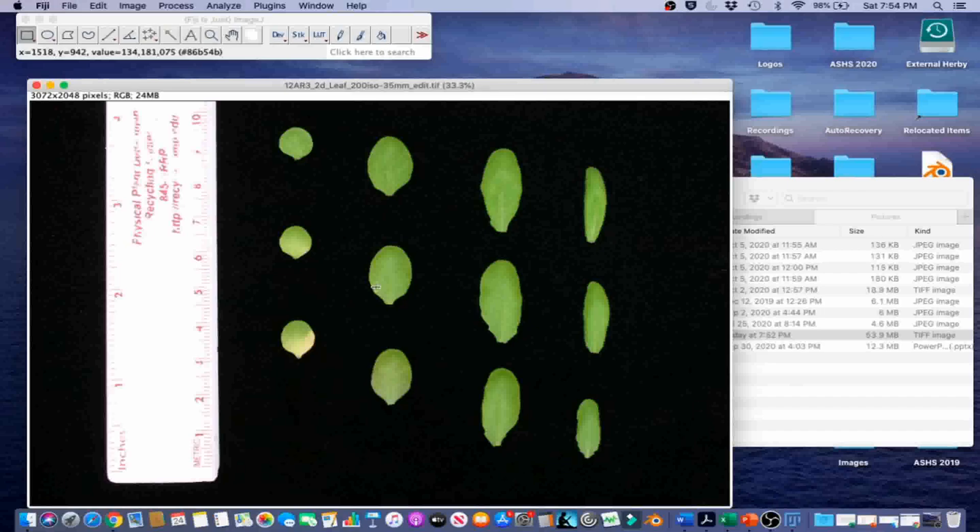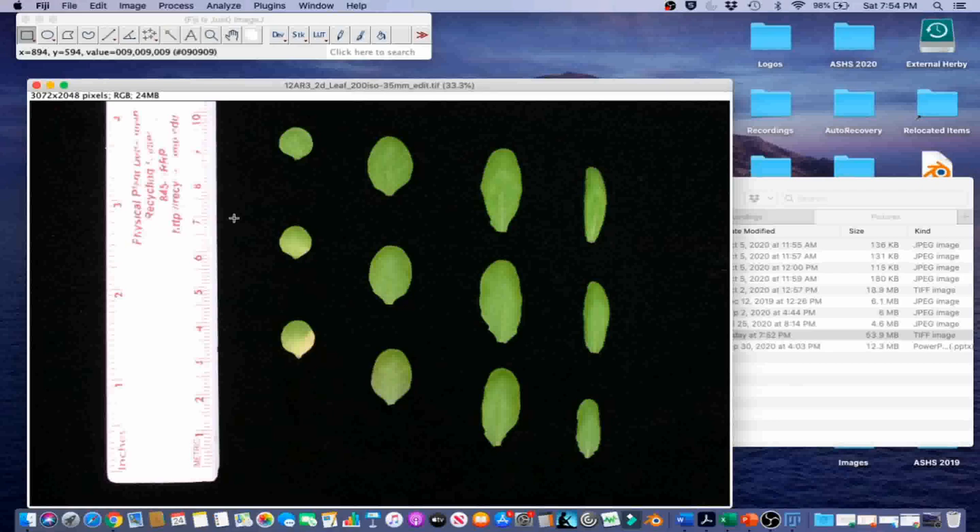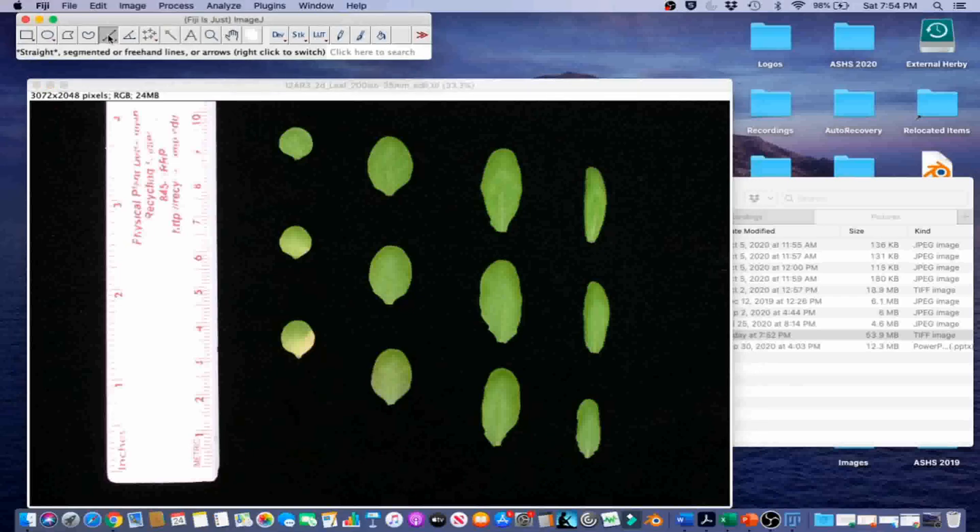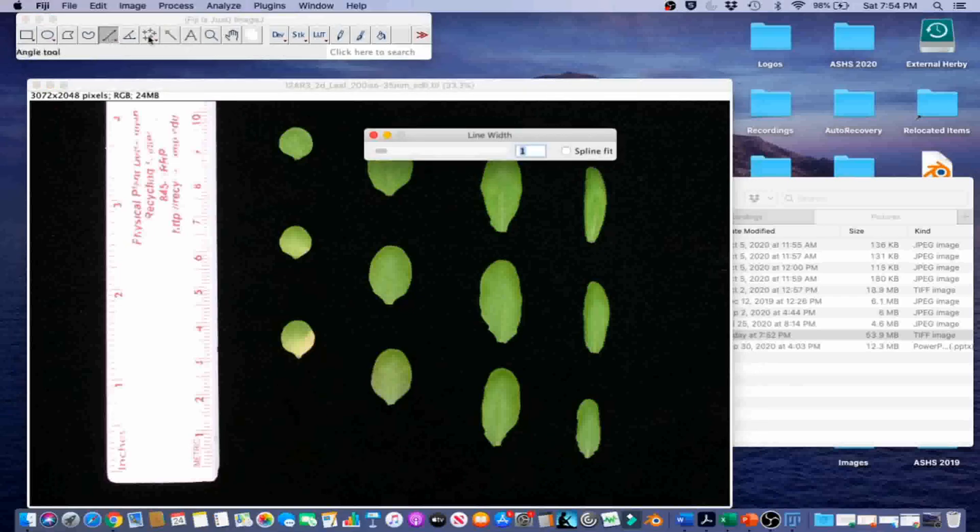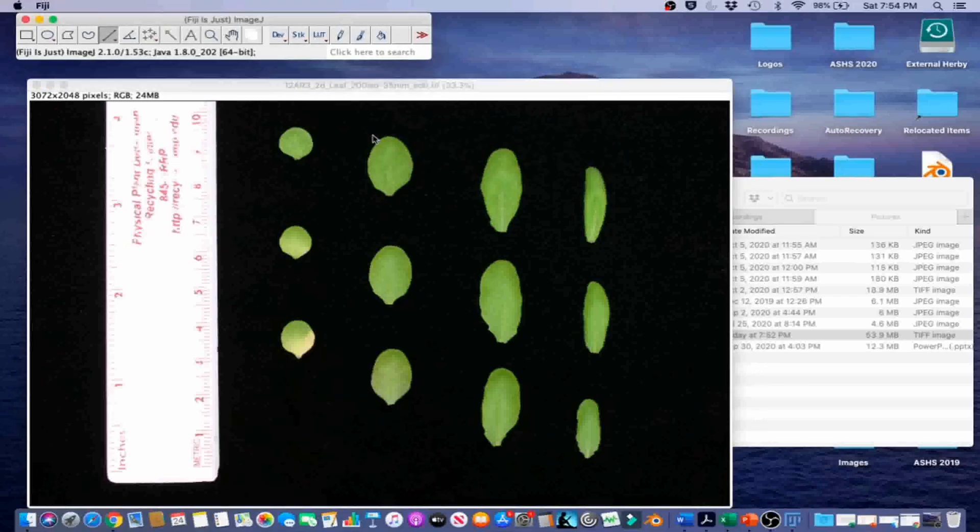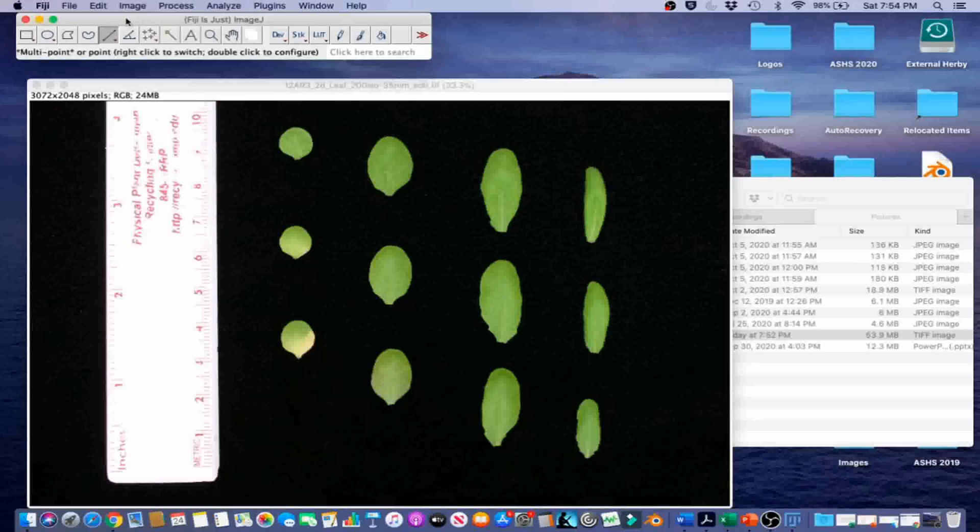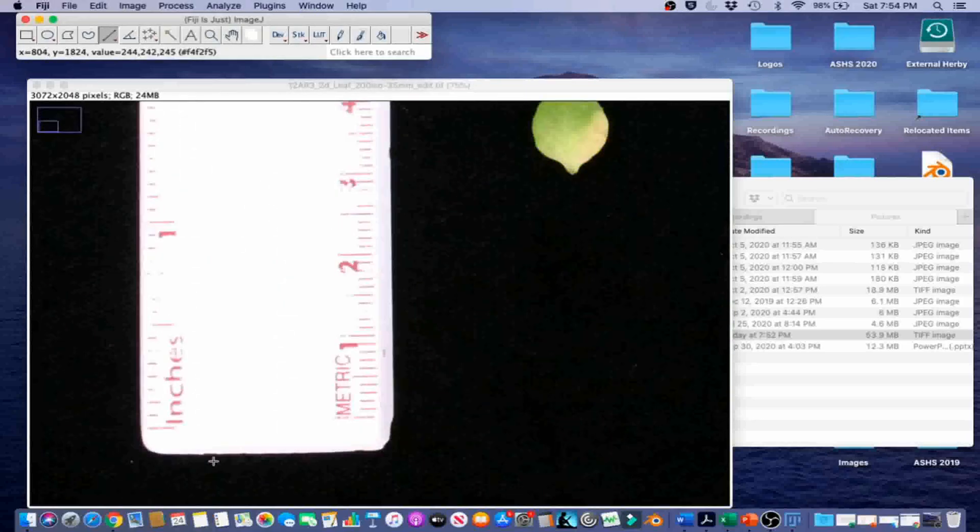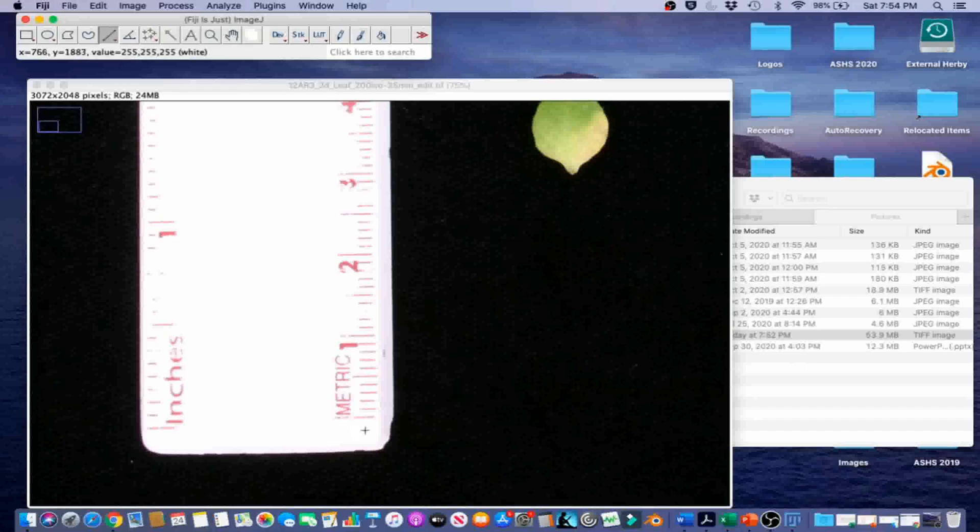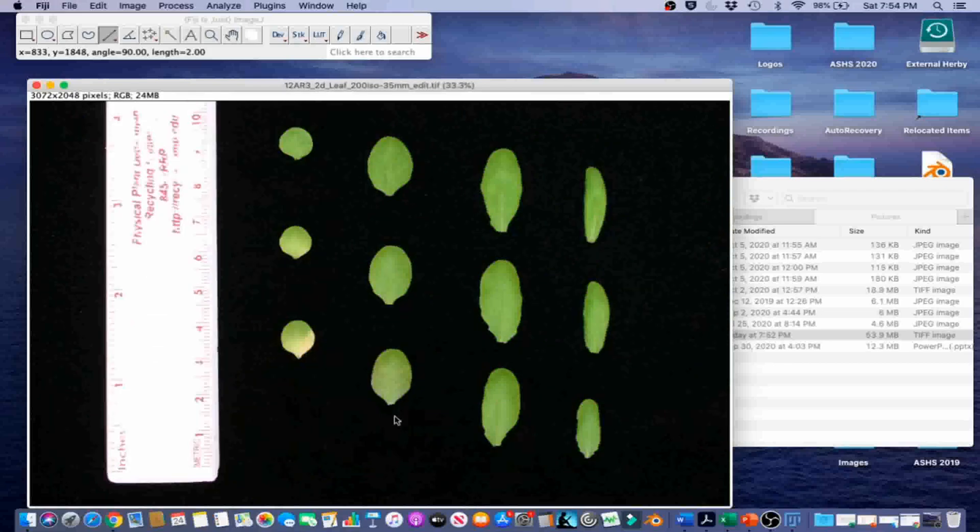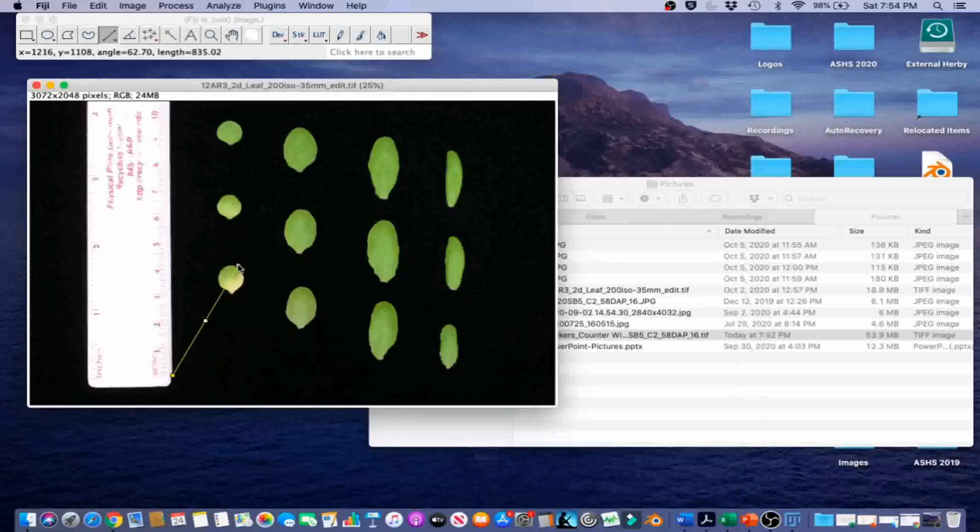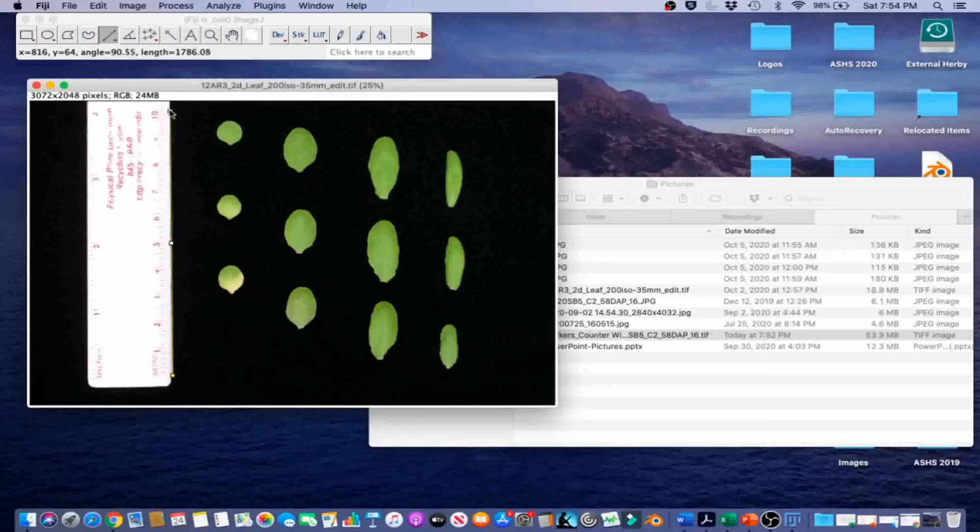We will begin processing this image by setting scale. For accurate image calibration, we need a large reference object of known size near the object of interest. The ruler in this image matches that description. Go ahead and select the straight line tool. We are going to draw a line along the length of the ruler. So there we go, I got it selected, and then we are going to zoom out again.